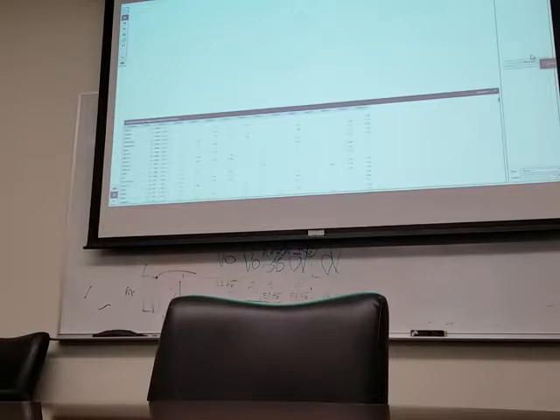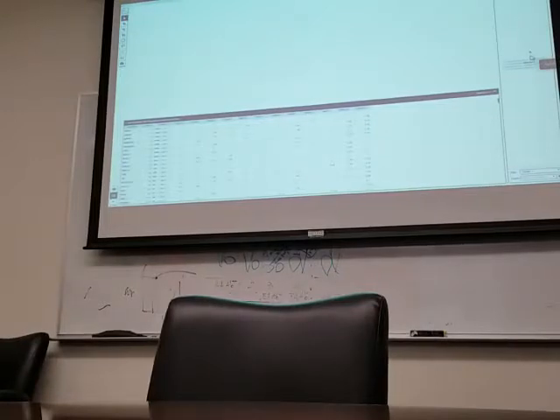Normally there's a column that says IGHV, and most of the time it would say something like IGHV 323. Sometimes it would say IGHV 323 semicolon IGHV 459. My naive interpretation was that it was an ambiguous call, or it was poor quality. So for the purposes of this exercise, I just eliminated those. That's good. And it sounds like it's about 10%. Well, it turns out we started with 2,000, and I narrowed it down to 1,600.